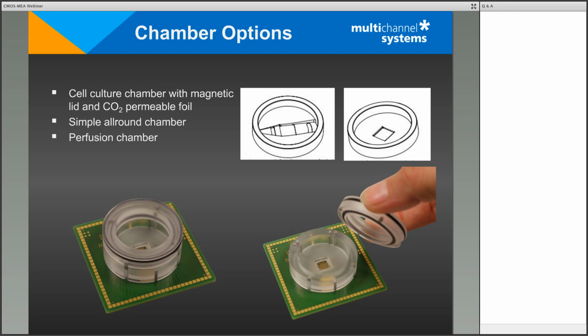One little difficulty is that we are restricted in a way that we have to cover most of the area around the actual sensor by the chamber. That's why we have that little hole here. We can't make that hole much larger, and we have a bit of a problem to put a slice grid inside that little area. So you need a rather small slice grid. However, if you solve that, there is no reason why it should not be used for the one or the other.